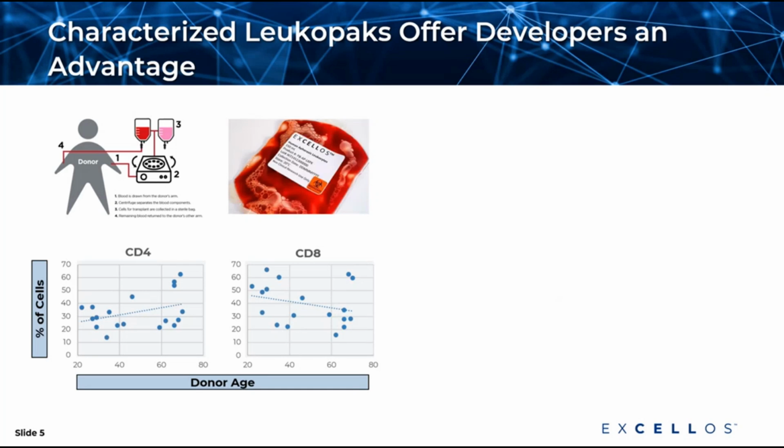And it's excellent because it gives us that high concentration of white blood cells that we're typically targeting for downstream selection and additional manufacturing. But when we go back into some of our internal databases we have around this, we're able to show this phenomenon where based on the donation age, for example, we're seeing differences in the immunophenotype where with increasing age, we see an increase in the CD4 populations and a decrease in the CD8 populations.